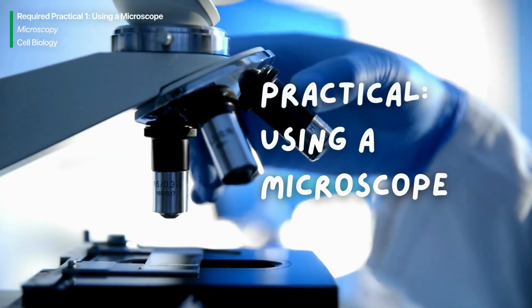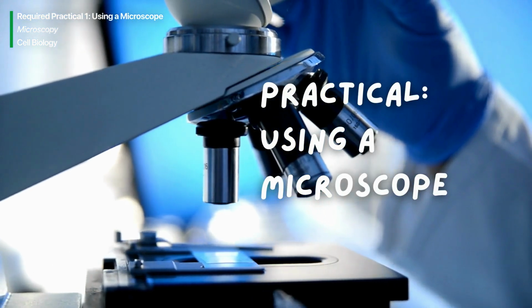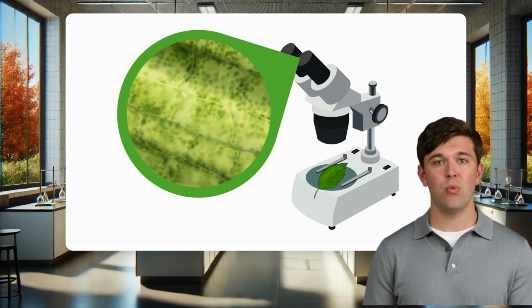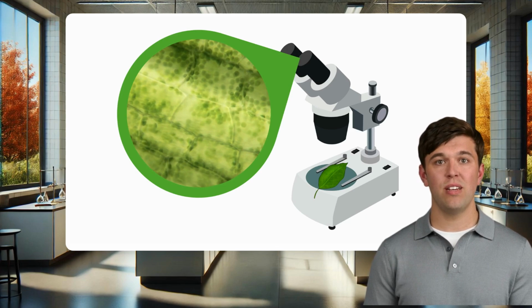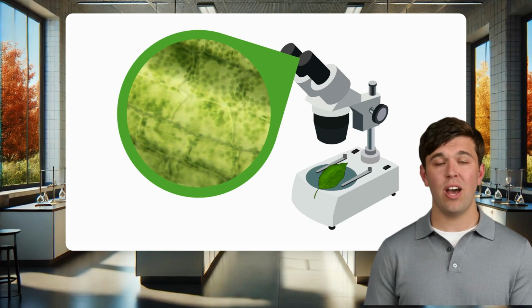Hello and welcome. Today, we're going to conduct a practical lesson in which we will learn to use a microscope. So far, we've covered some fundamental concepts about cells. We've learned that cells are incredibly small structures, so tiny that they can't be seen with the naked eye. To observe these cells, we need to use magnification tools, like microscopes. Now, we're going to bring all this knowledge into action with a hands-on practical.